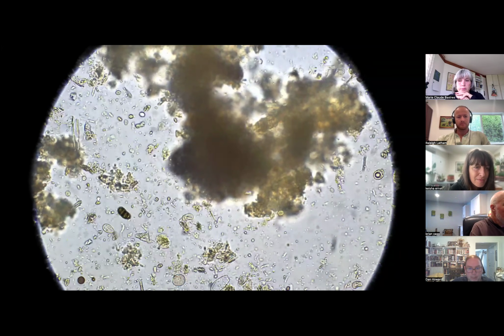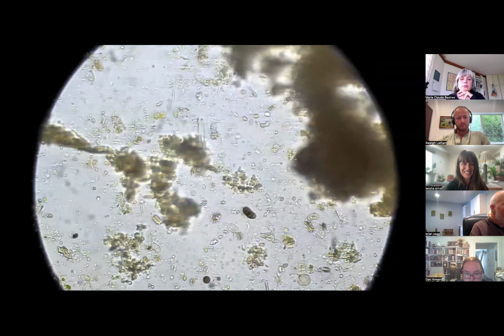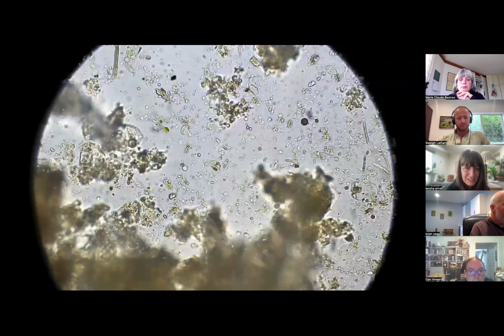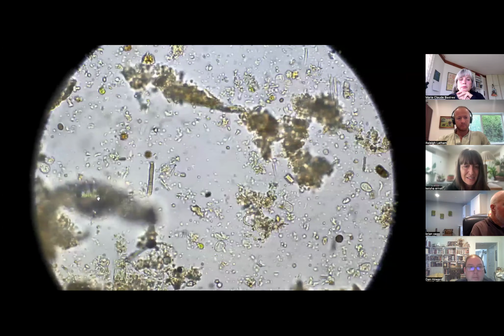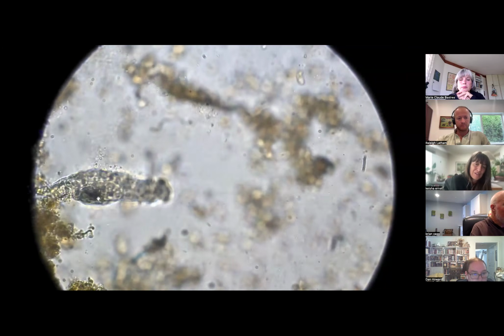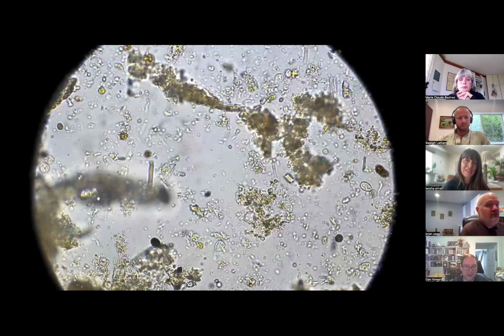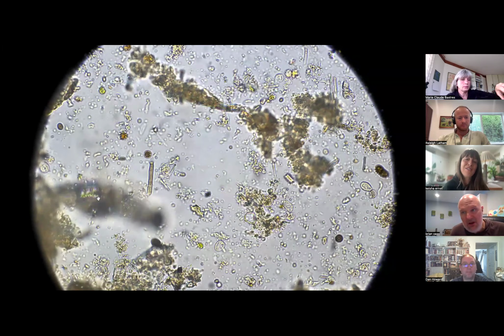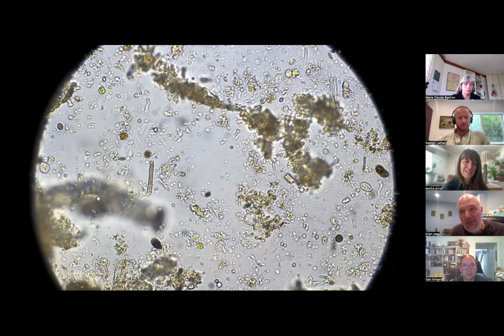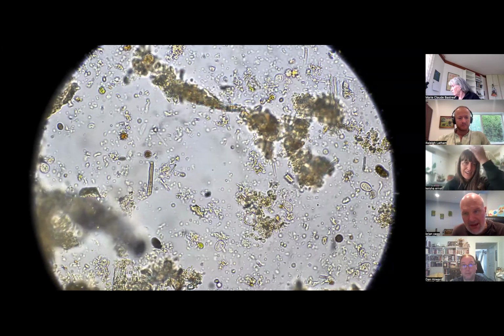Although what's really wild is that just the hour that I let it sit since I made up the prep, it added a lot of aerobicness back into here. So a lot of the anaerobic bacteria, I was seeing a tremendous amount of spirochetes all over. I mean, probably 50 in a field of view. It was a crazy amount of them.